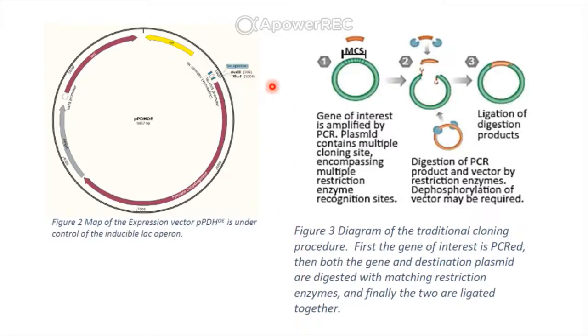And you have two restriction enzymes, this AvrII and XbaI. And that's going to be your cloning region. Using this traditional cloning paradigm, you're going to insert your GFP just before pyruvate dehydrogenase, and they're going to share the same promoter system. So if GFP is being expressed, pyruvate dehydrogenase is being expressed, and vice versa. And in that way, GFP will act as an excellent reporter gene for the expression of your pyruvate dehydrogenase.